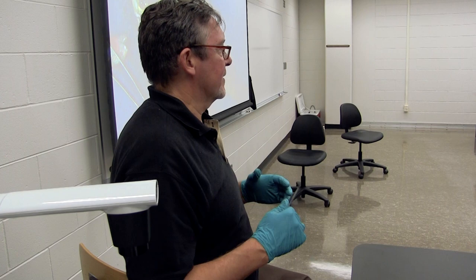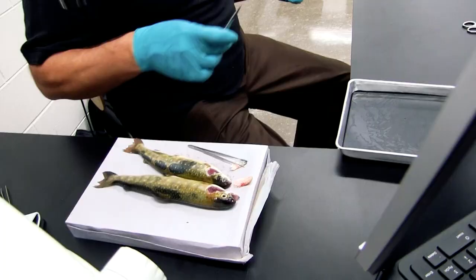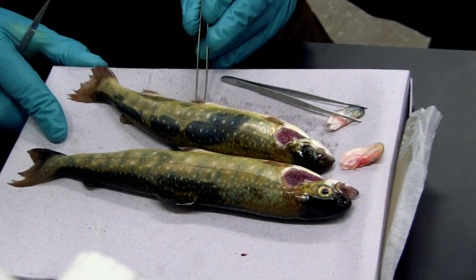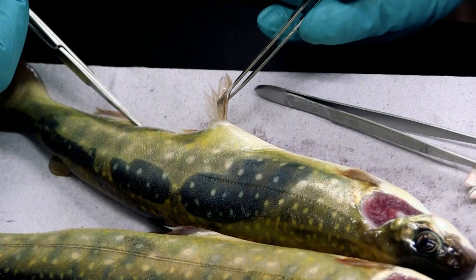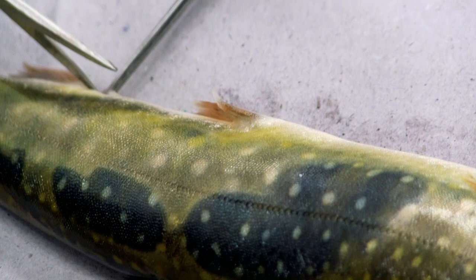With these fish, we're opening up the coelomic cavity to get an assessment of how well your fish are doing on your farm. There are a couple different techniques for doing this. One that was talked about this morning involves starting at the vent. You're going to pick up a little flap there and then just start a small incision — you've got to go through the body wall.